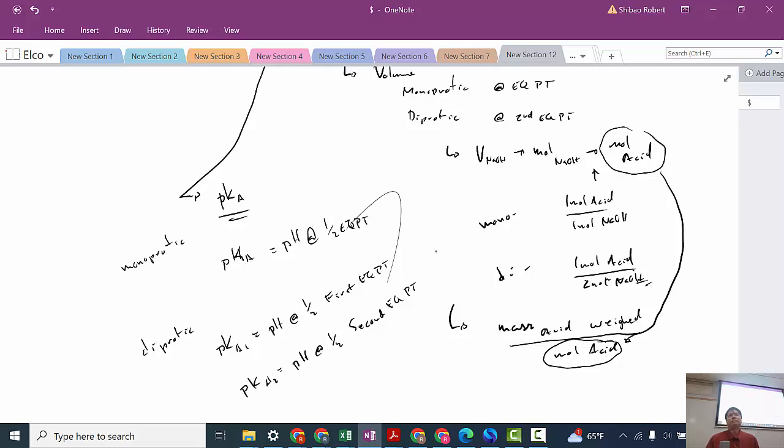So there are lots of things that can impact your pKa values. One, what if you use your neighbor's pH meter? Would you have gotten the exact same pKa value? Two, what if you miscalibrated the pH meter, so it was systematically off each time? There are lots of things that can impact pH measurements.